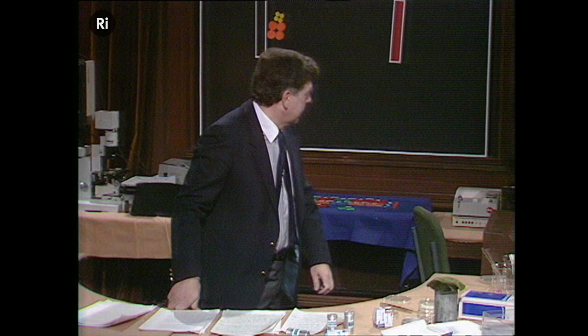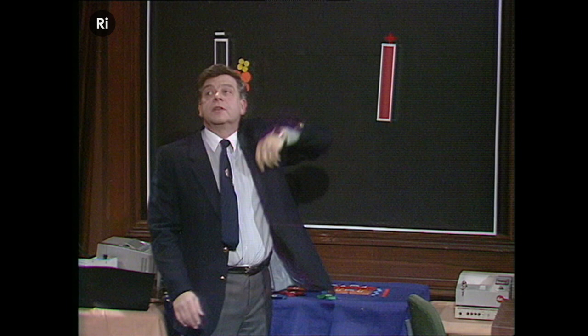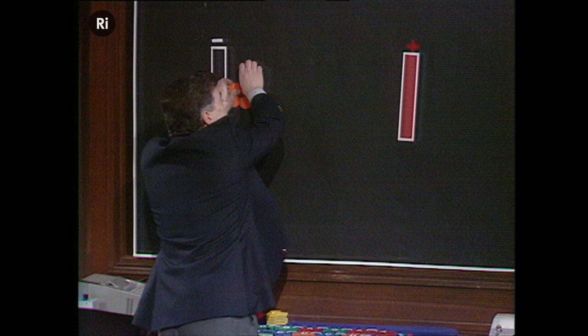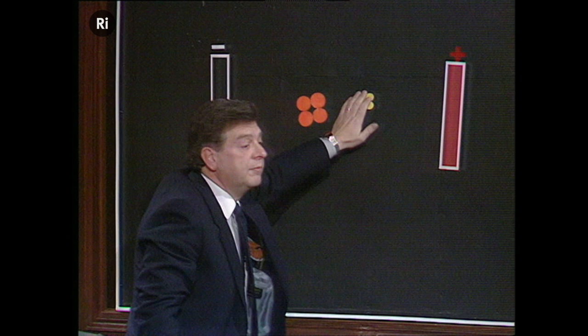So you see, what we've got here is a negative and a positive in our solution. And the current can flow from the negative to the positive. And we put in that a mixture of molecules, big ones and little ones. So as the current flows, what happens? The molecules, they move along. But the little ones move quicker than the big ones. So after a period of time, we've separated them. The little ones have moved further than the big ones. We've separated out molecules of different size.